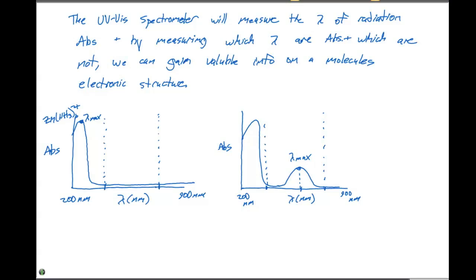A pink colored complex, we could say, is very similar to red. So we have to look at the complement, and it's going to absorb right in the green portion of the visible spectrum. Yeah? So even if there's an absorbance that's higher than the one in the visible spectrum, if there's an absorbance in the visible spectrum, that's the lambda max? Yeah, so, well, you could say for the cobalt compound, we probably would look at 2 lambda maxes, meaning it's the maximum of a particular peak.